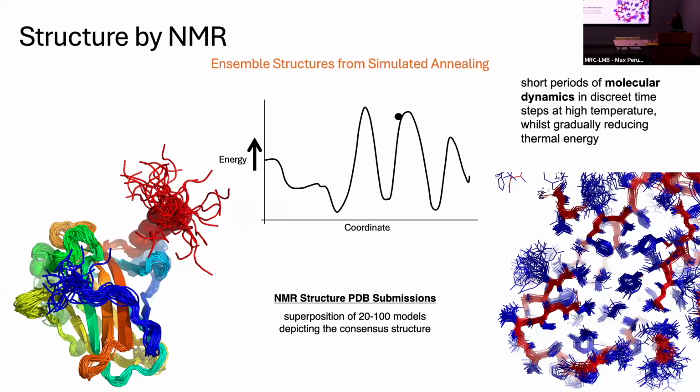I think one thing that is quite interesting when you look at your structure is that the core of the protein has a very close agreement, very small RMSD differences in the core, in the secondary structure elements, but you can get some heterogeneity in loop regions and in the termini. That can be simply because there's a lack of restraint there. There aren't that many restraints for those termini, so you can start to see that perhaps these regions are sampling more than one position in three-dimensional space.